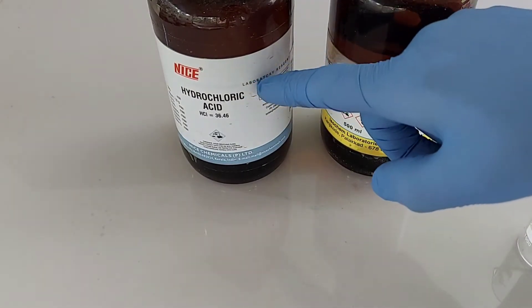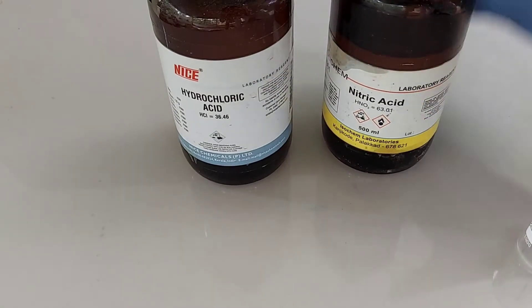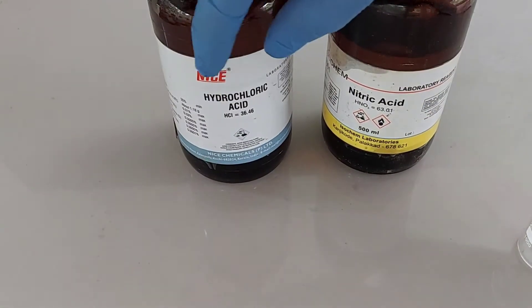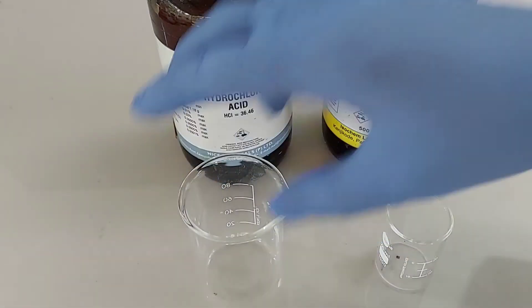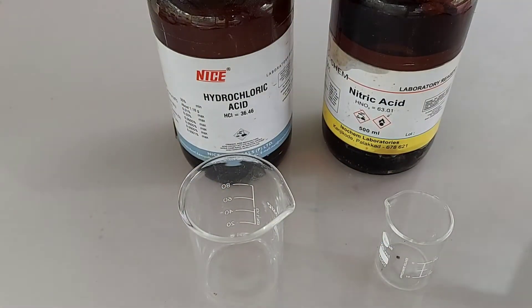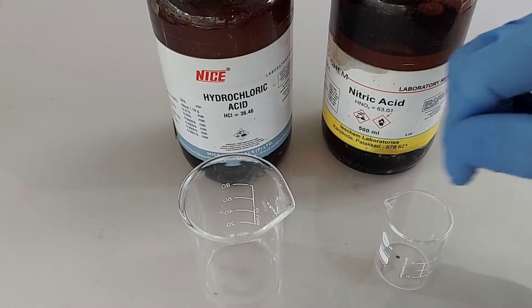For making Aqua Regia, we need both hydrochloric acid and nitric acid. Aqua Regia is a mixture of hydrochloric acid and nitric acid in a 3 to 1 ratio. We need 3 parts of hydrochloric acid and 1 part of nitric acid.